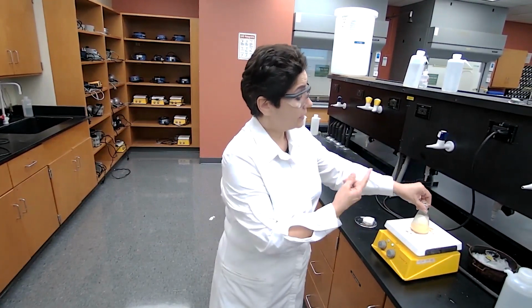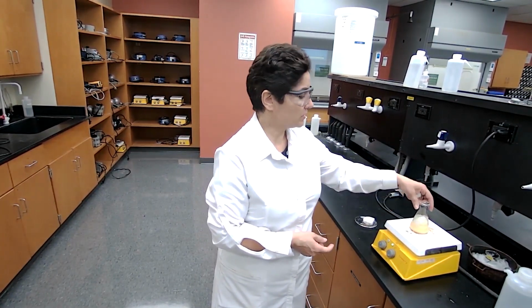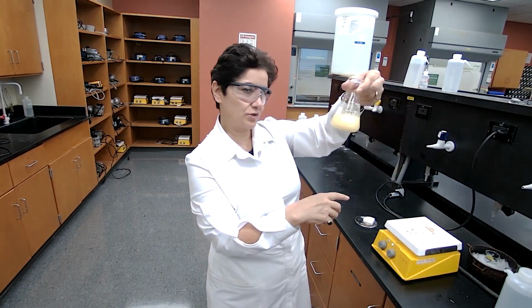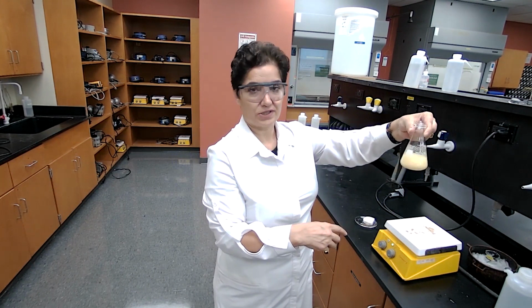30 minutes of stirring of the mixture is up. We have plenty of crystals. The powder or the cloudiness shows that the crystals have formed. So it's time for vacuum filtration.